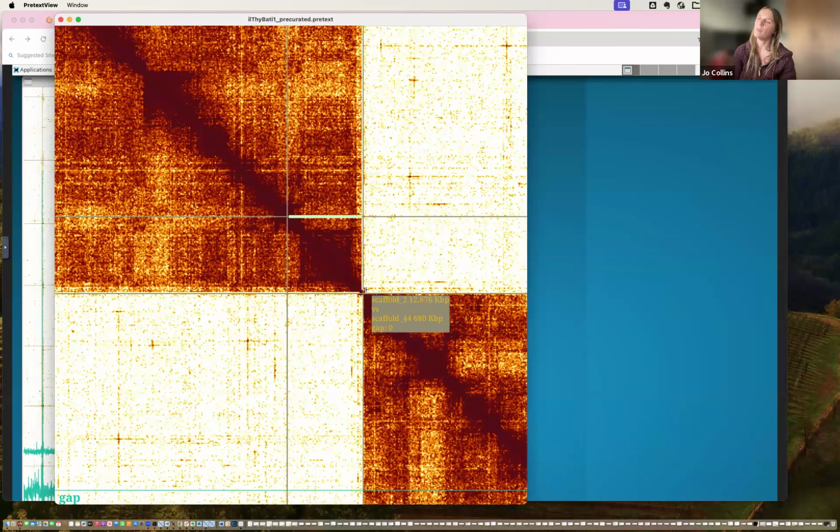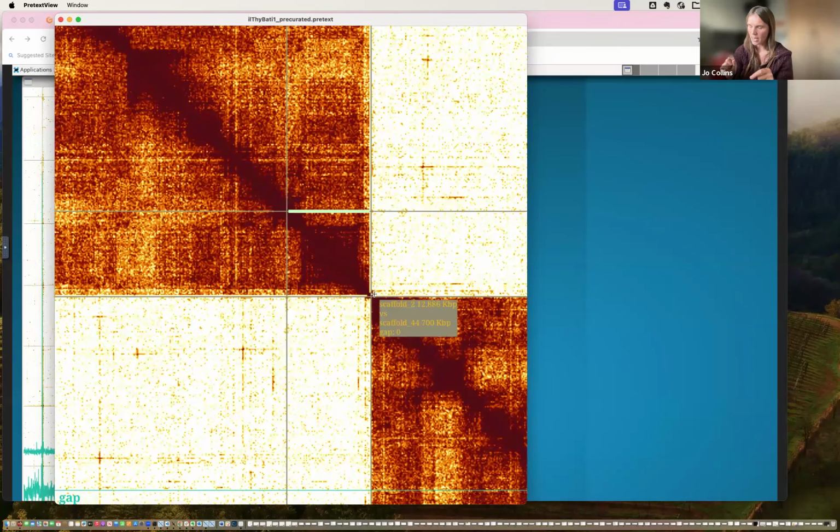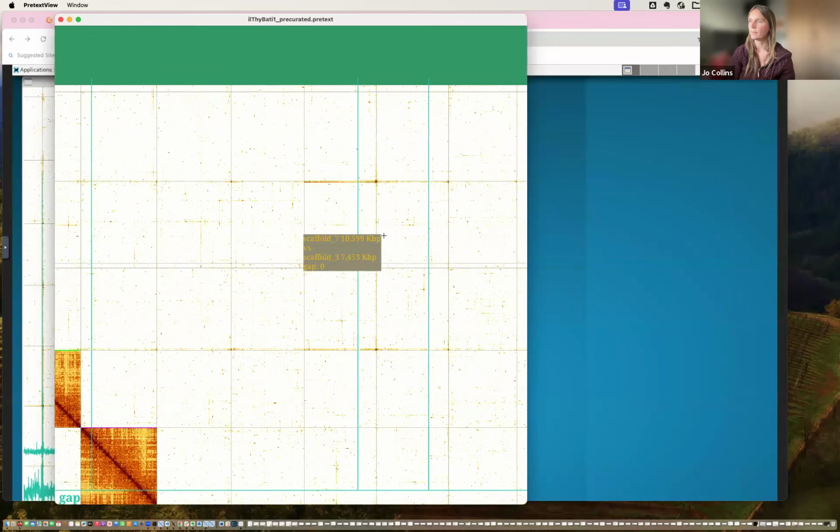telomere track because the telomere repeat motif has been tagged, but often you can see it visually, because we can look at regions on the ends of our chromosomes that light each other up and have that cross affinity. That also helps us determine, not just in Lepidoptera but in other species where they can be more difficult to assemble, that's quite often a good tell to see if you've got your assembly arms constructed in the right order and orientation. Right, so there was another piece of this scaffold.